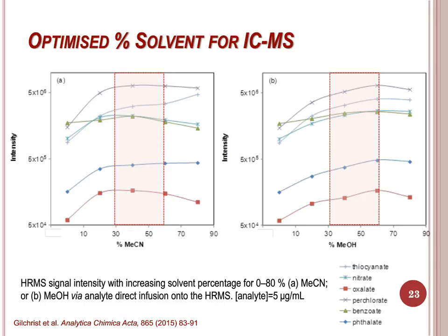solvent additives. Relatively lower solvent compositions could be considered advantageous for practical coupling to mass spec for small anions for several reasons, including increased solubility of sodium hydroxide in the eluent, improved suppressor performance and potential operational lifetime, and increased mass spec sensitivity through improved electrospray generation.